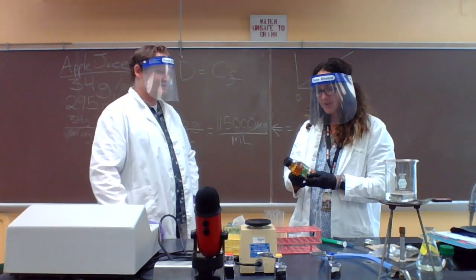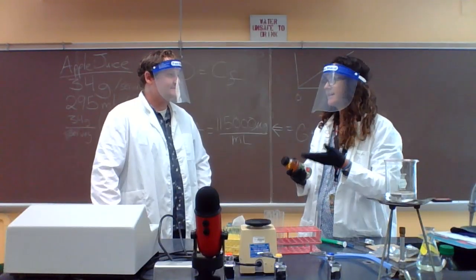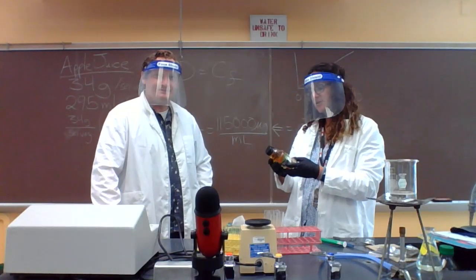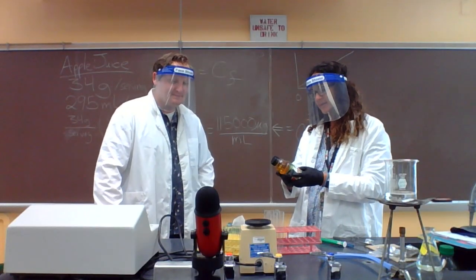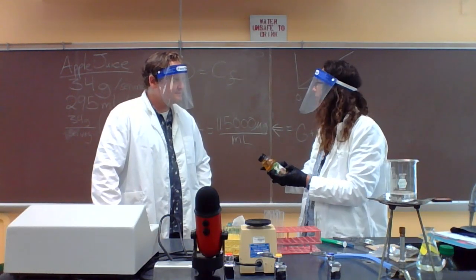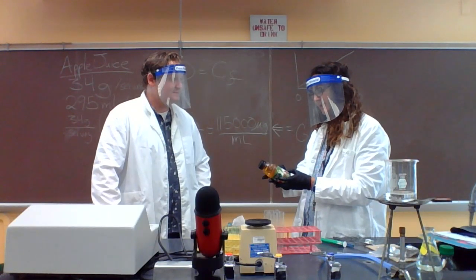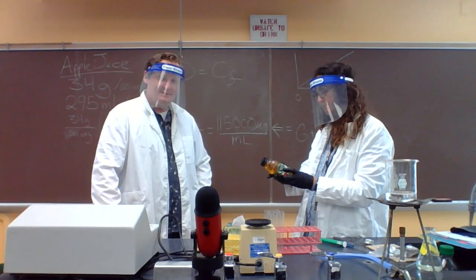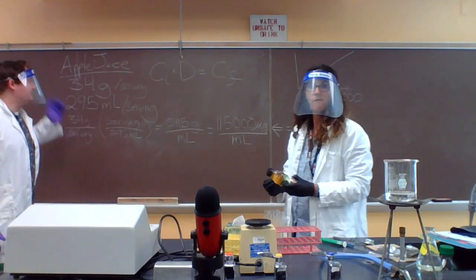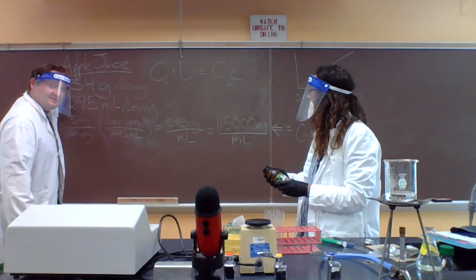Okay. So when you get allotted which beverage you're going to do, you look at the nutritional information, and on the back it tells you the number of carbs. So 34 grams of carbohydrates per serving, and the serving size is 1 bottle, which is 295 mils. So we have 34 grams of carbohydrates in 295 milliliters of fluid.